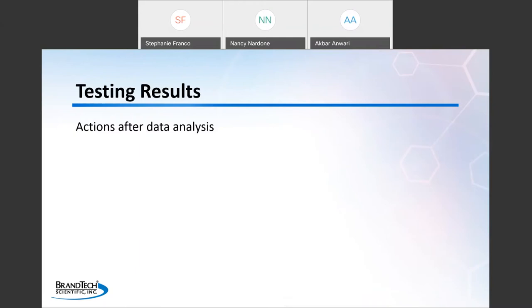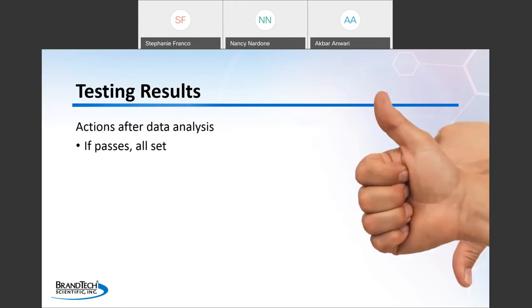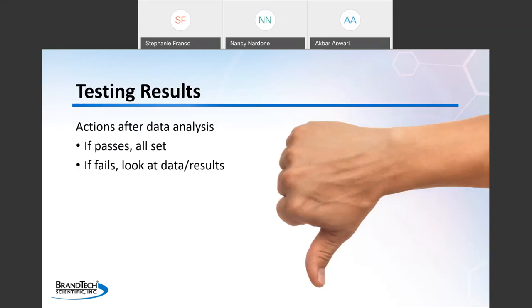So after the testing is complete and the data has been analyzed, what then? Well, if the instrument passes, you're all set, good to go. The instrument can be put back into service. But if the instrument fails, it's important to look at the individual data and results and where exactly it failed before taking any next steps.